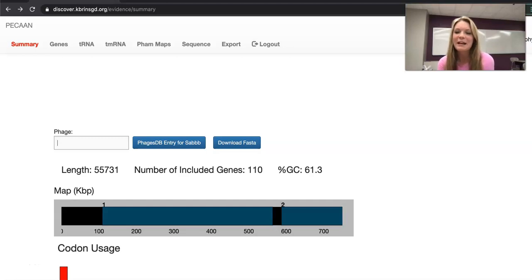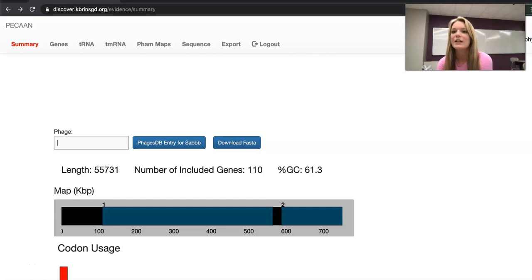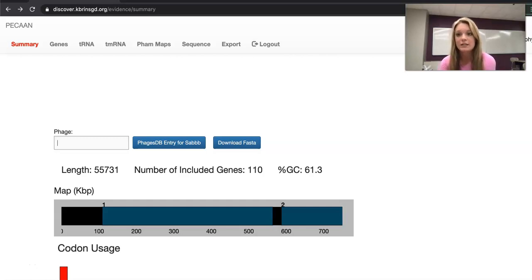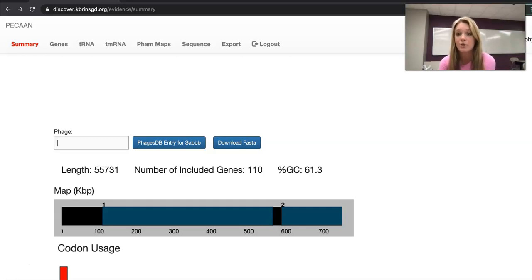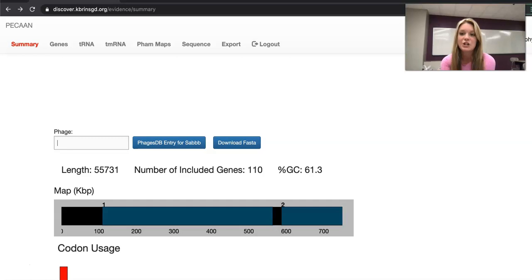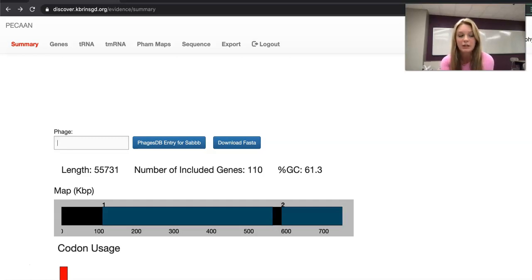Hello everyone, my name is Grace and I'm going to be talking about Pecan and HHPred. To get started, let's get some background information on Pecan. Pecan is basically an easy compilation of all the databases talked about in the other videos you've watched. It functions as a shared note-taking website for all the annotations that people have made individually.